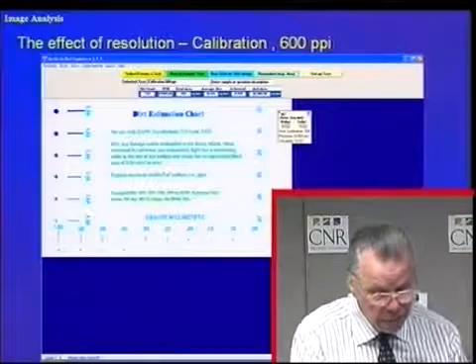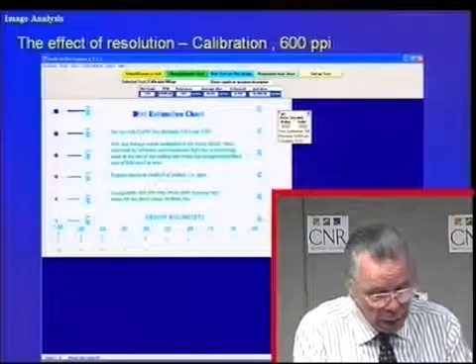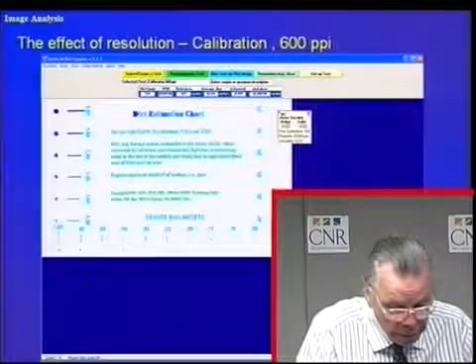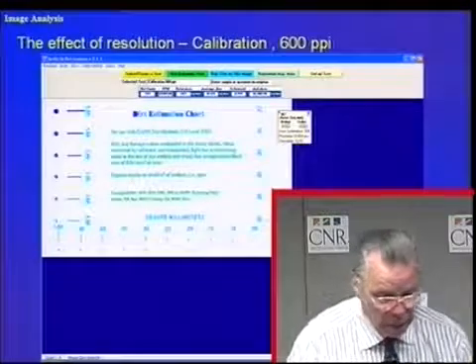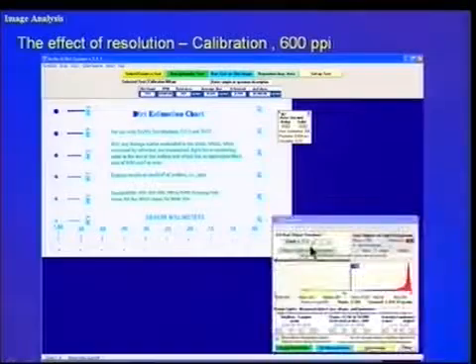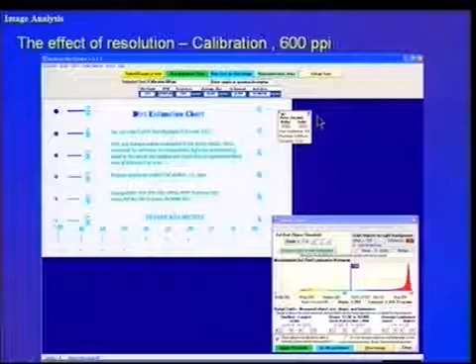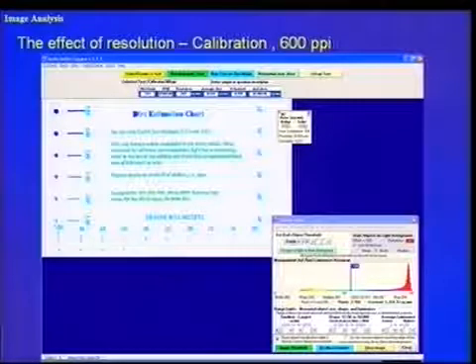You see here, to acquire the dot accurately, to emulate what is on the card, we can set the threshold at 105 and a threshold of about 138. This gives us a reading of 0.022 square millimeters. But remember, the card is idealized.